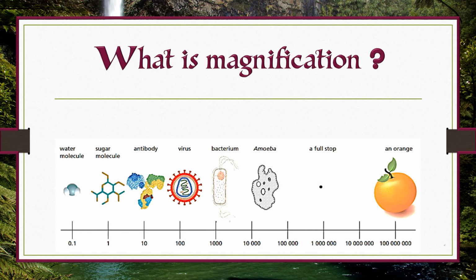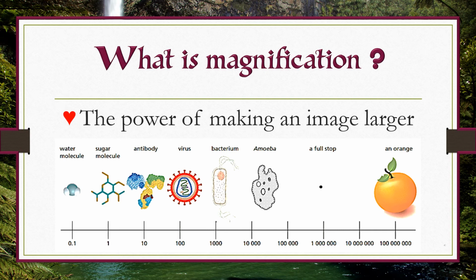What is magnification? The power of making an image larger is what we call magnification.